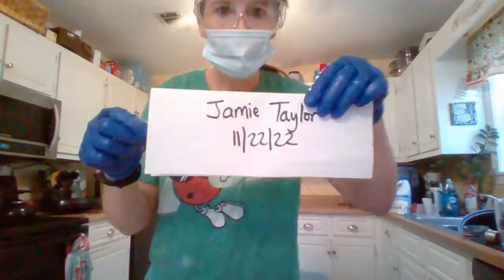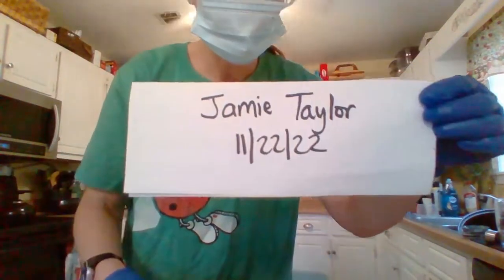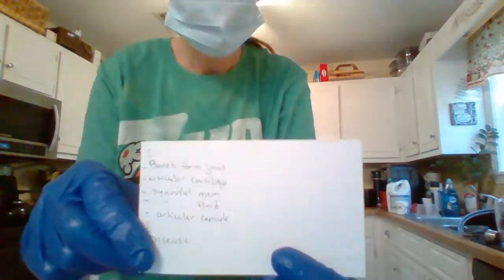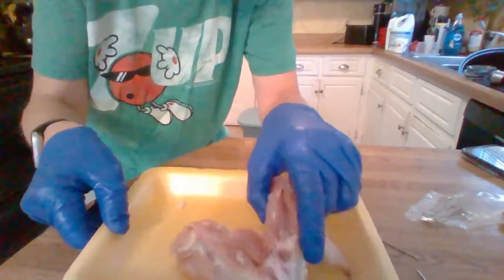This is Jamie Taylor, and today is November 22nd, and I'm going to be talking about the chicken wing dissection. And here are the note cards that just make sure I talk about what was asked. And I'm trying to position this where we can kind of see it.